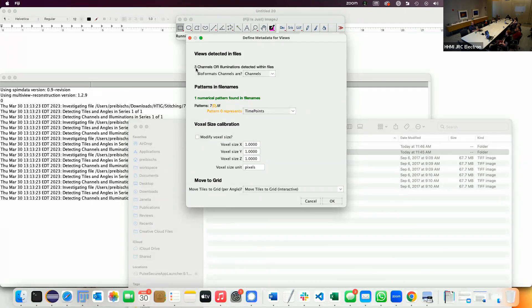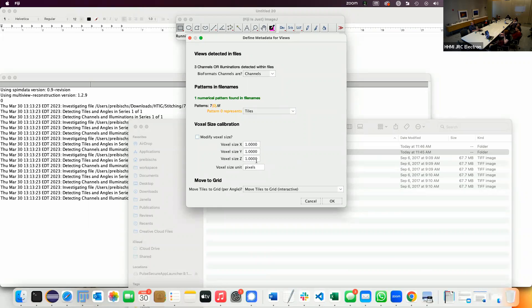Then it asks you — I detected three channels or illuminations. It asks because BioFormats still does not distinguish those, so it has to ask the user. It automatically detects patterns in your file names and highlights them. There can also be two or three patterns if you have time points and angles. You can also ignore a pattern — if people put timestamps in the filename you can just ignore that. It will try to read the voxel size as the most basic metadata parameter. In this case it's gone because originally these were LSM files and we saved as TIFF.